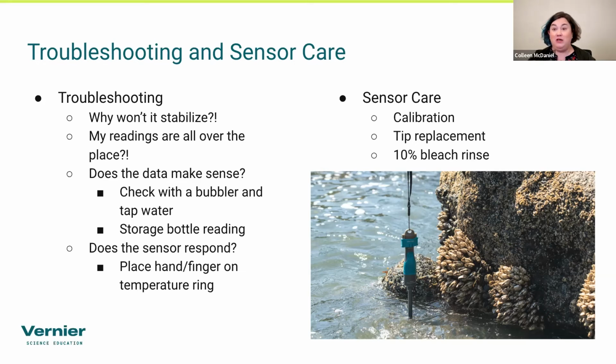If people have, we need to know. But we have the same kind of grooves on the Go Direct one, so that same light shield will fit them, along with that same metal guard for field use.